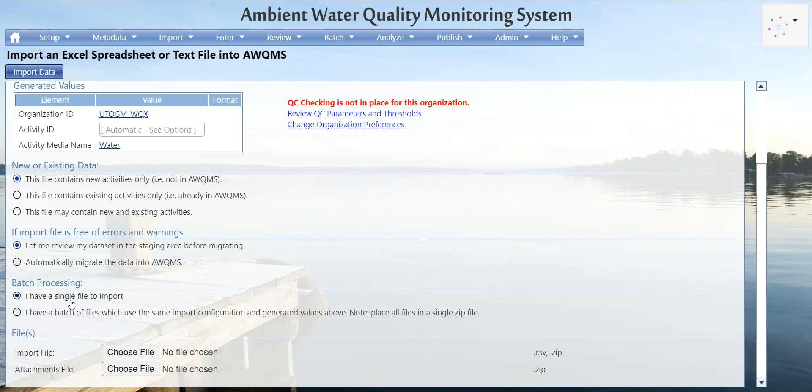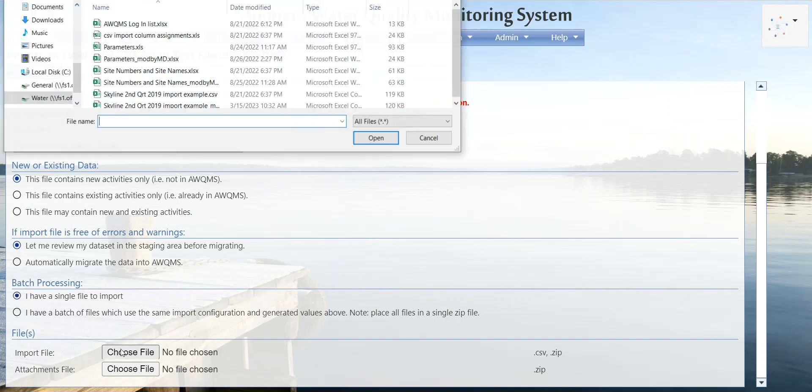You also have the capability to batch process in Aquums. If you have a batch of files that use the same import configuration and generated values, you can place them all in a single compressed ZIP file, choose that ZIP file, and click Import Data. Just make sure they all use the same import configuration and generated values.